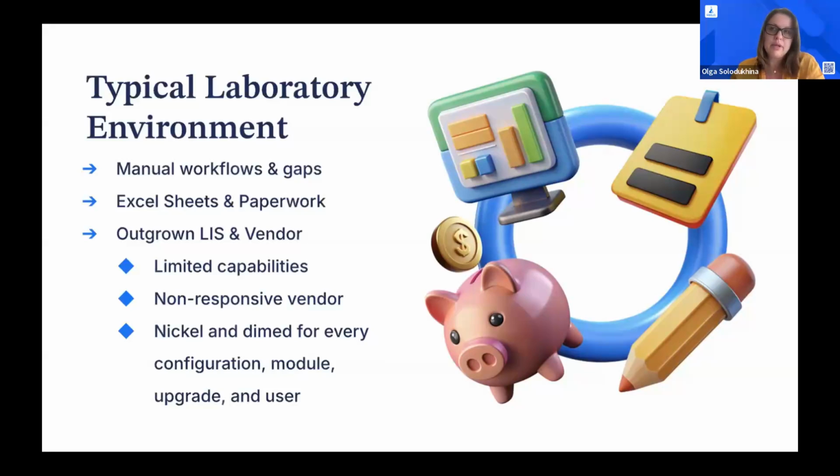Another thing we see is a lot of labs outgrow the solutions they have. When they become bigger, they need a better solution. The limited capabilities of other legacy systems just don't manage what you need in the modern world.